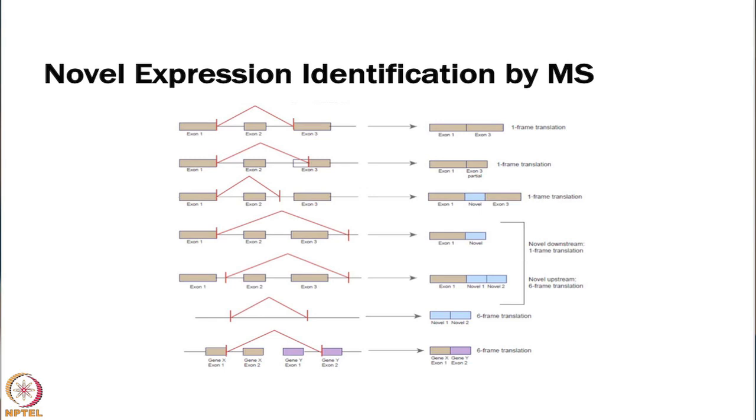That's one example. You could have an example where one exon is connected to the middle of another exon, so it chops off the beginning of it. Or maybe one exon is connected to an intronic region, so it's actually adding on some sequence before the annotated exon. Or maybe it's in an intergenic region, past where we think the gene ends can occur. Or maybe it's just completely novel. Maybe there are no annotated exon boundaries that exist. So there's a lot of different ways that these things can be combined.